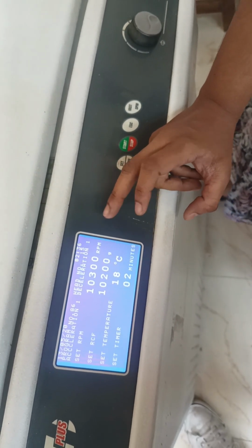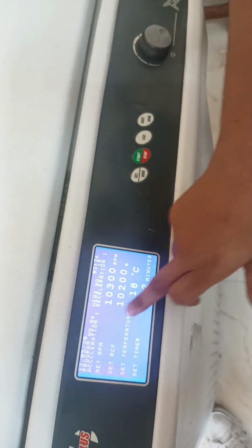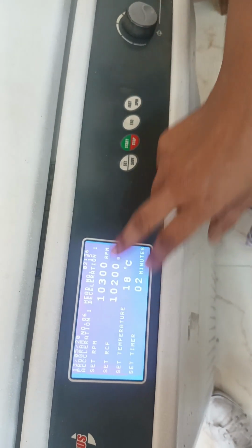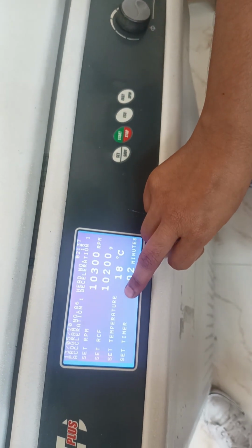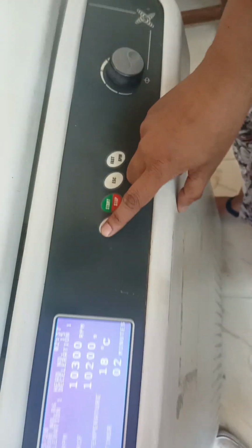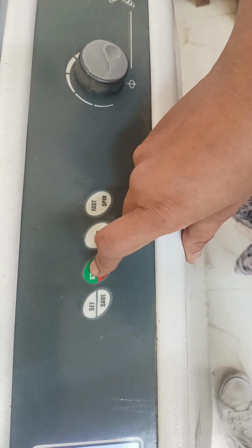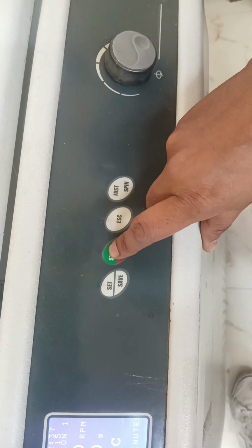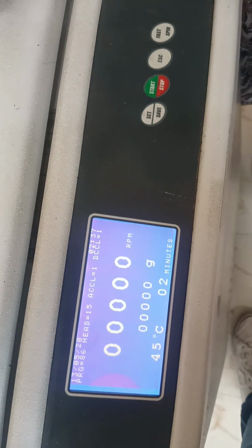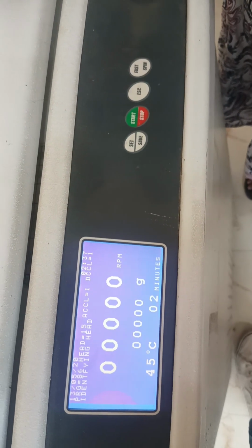As I have already used this setup previously, the information about the RPM, the RCF and the temperature has already been fed to this machine, and I have already set the timer to 2 minutes. Now I will press the set button and start it. In this manner we have to utilize this. So I will now start the machine. Slowly the speed will increase and you will get the separated solutions.